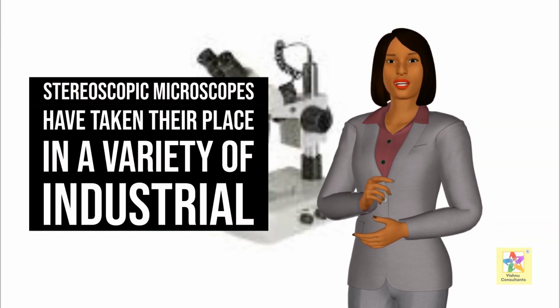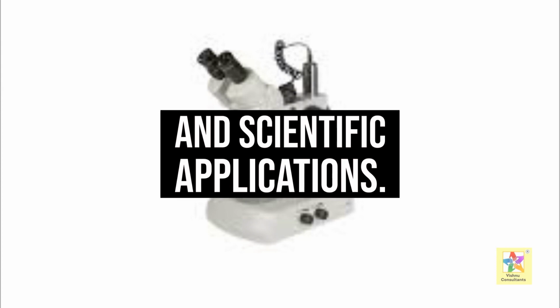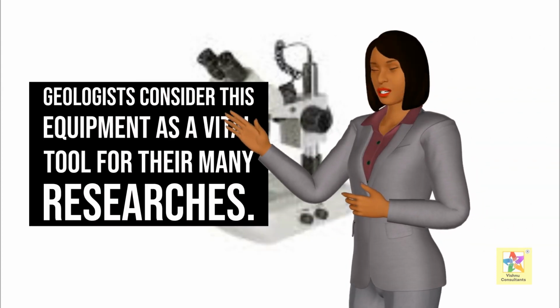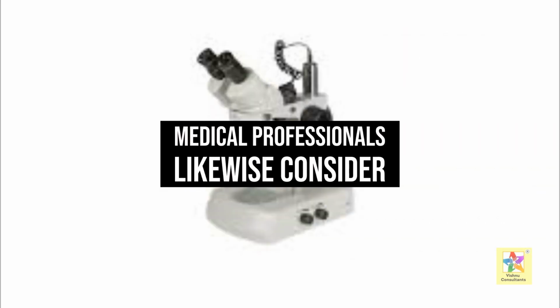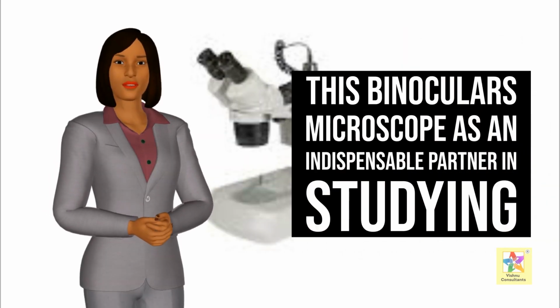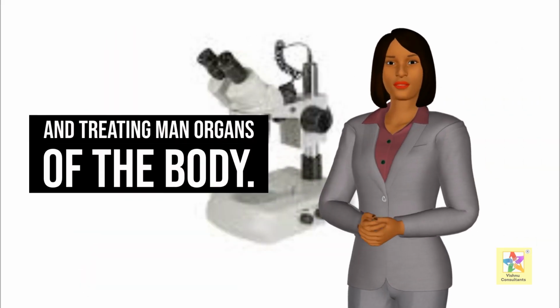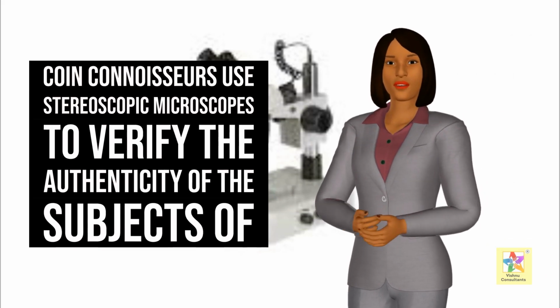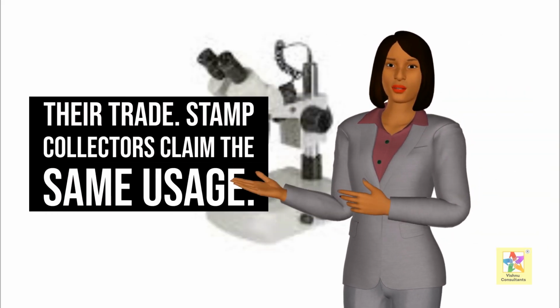Stereoscopic microscopes have taken their place in a variety of industrial and scientific applications. Geologists consider this equipment as a vital tool for their many researches. Medical professionals likewise consider this binoculars microscope as an indispensable partner in studying and treating many organs of the body. Coin connoisseurs use stereoscopic microscopes to verify the authenticity of the subjects of their trade. Stamp collectors claim the same usage.